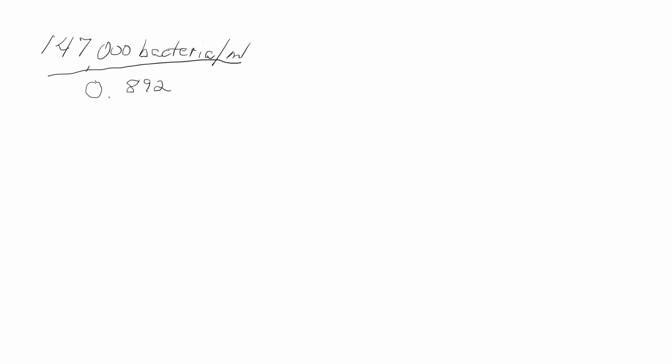Where did this number come from? This came from back when you put that sample in the spectrophotometer, and I told you how you close the lid and it gives you the number on that little screen that I showed you. This was the number that came up there. This would be the absorbance, which means you're measuring the amount of light that did not pass through. Transmission is where you measure the amount that went through. Absorbance is the reverse of that.